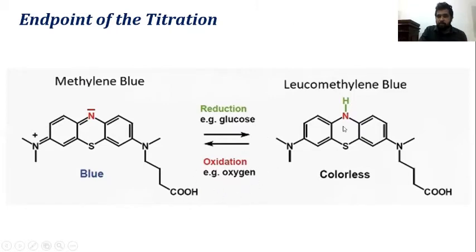And you know that when we provide heated conditions, we can remove the dissolved oxygen, and it also helps to increase the rate of the redox reaction, as well as to release the bound sugar in the sugar solution. You know, food is a complex material. If you use a food material, providing heated conditions will help to release the bound sugar. Okay, that is another reason for using heated conditions.